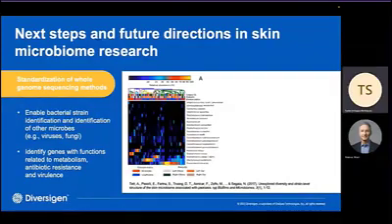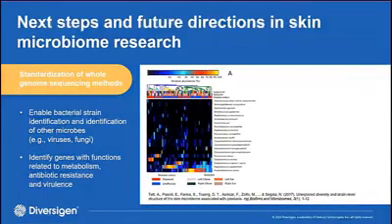As we continue optimizing skin microbiome research from sample collection to data analysis, additional techniques can be considered for the analysis of skin microbiome samples to, for example, dig deeper into health and disease, determine any multi-kingdom interactions, and also develop therapeutic approaches. So let's talk about some of these in more detail. Although we know that 16S sequencing is among the preferred methods for skin microbiome research, standardization of other approaches will also enable the study of skin microbiome samples in relation to skin health and disease.